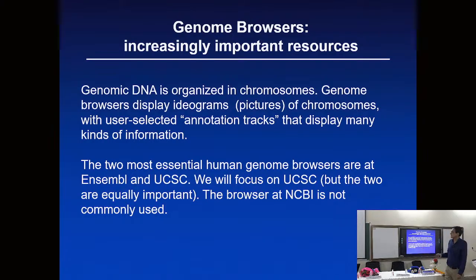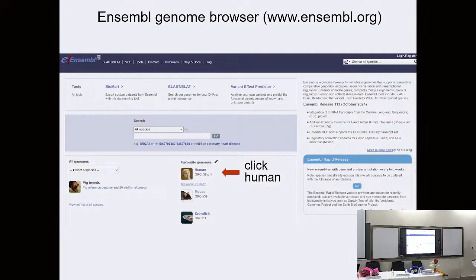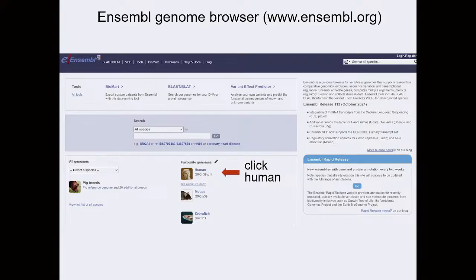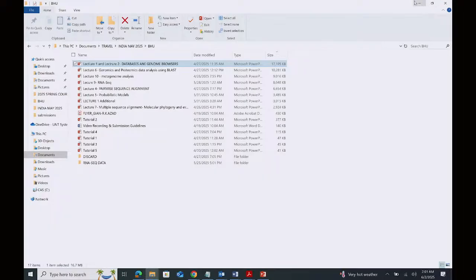Okay, so let's get to the next. What happened? Okay, it's going. I don't know why this is not working for some reason. So I will do from here. Not to worry. Yeah, the Ensembl genome browser. Actually, we will go here, we were doing here.